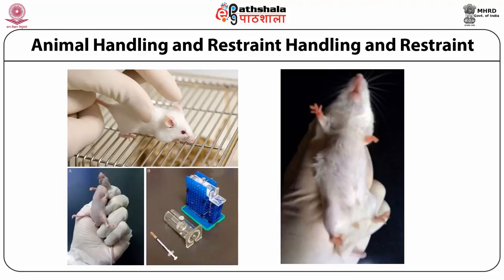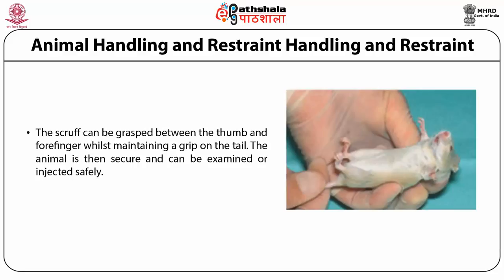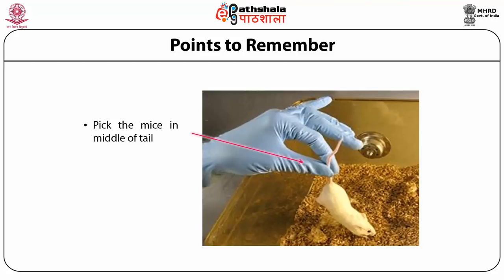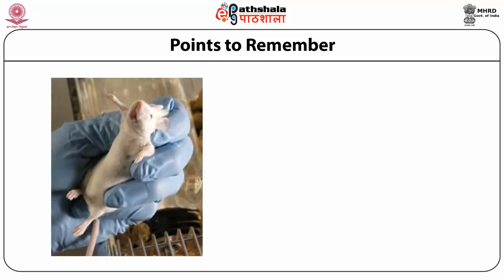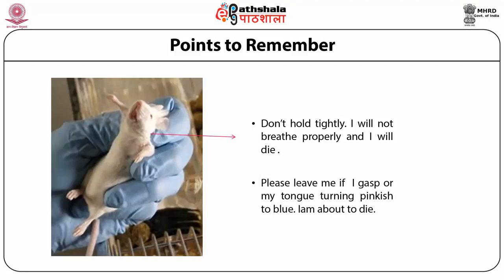If you don't handle the mouse properly, the animal will die. The mouse is grasped between the thumb and forefinger while maintaining a grip on the tail — the animal is then secure and can be examined or injected safely with no biting. Always pick the mouse at the middle of the tail, not the tip, or the tail skin can degloving. During holding, it is important to grip the scruff properly — if held too tightly the mouse cannot breathe and the tongue turns blue, leading to death.